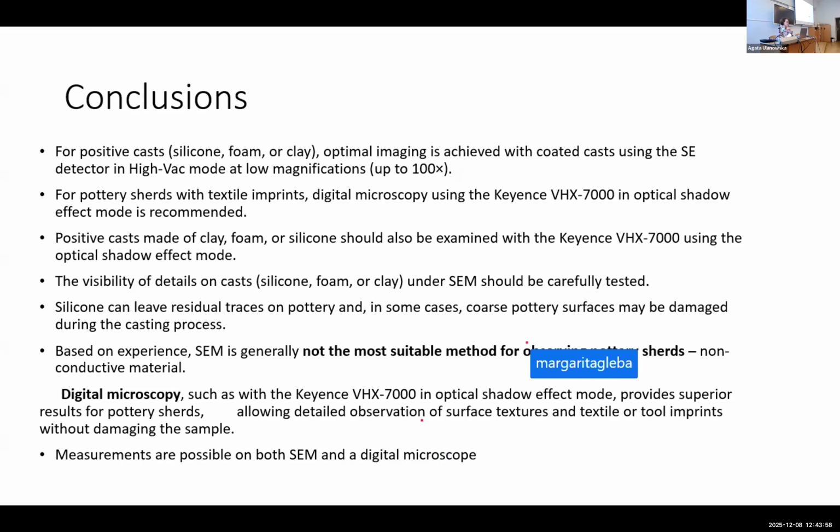Based on my experience in SEM, it is generally not the most suitable method for observing pottery shards. The images are really bad because it's non-conductive material. And with digital microscopy, we will have superior results for pottery shards. It will allow detailed observation of surface textures or tool imprints without damaging the sample. Of course, measurements are possible on both the SEM and the digital microscope. Just the one disadvantage: this is not mobile.